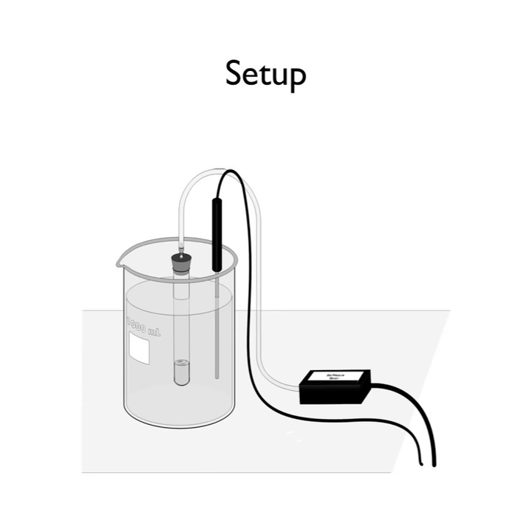Rinse and clean the graduated cylinder that you have used already for the potassium iodide solution. Add a fresh batch of 2 milliliters of 0.5 molar potassium iodide solution to the graduated cylinder. Draw 1 milliliter of the potassium iodide solution into a plastic barrel pipette. Invert the pipette and immerse the reservoir end of the pipette in the water bath. Allow both the test tube and the barrel pipette to remain in the water bath for at least 2 minutes before proceeding. And then collect data, store the data, and analyze as we did in the last part of part 1.